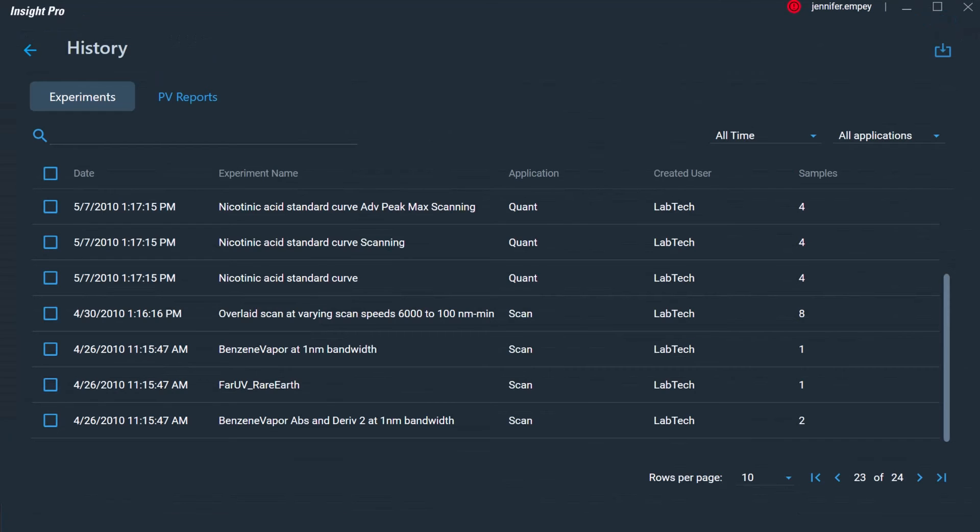For all experimental methods, the data is automatically saved in a database format and can be recalled at a later time. This saving mechanism ensures that the data is not lost, aiding in data integrity compliance necessary to follow 21 CFR Part 11 requirements.